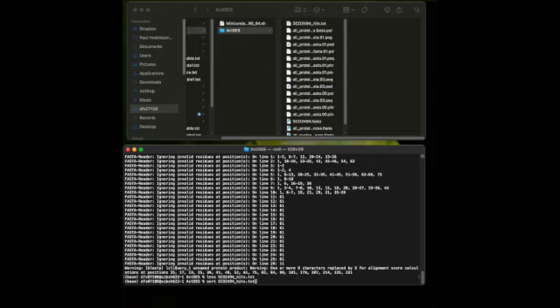And then what we can do is pipe that and use the unique function to identify all of the unique lines within that file, and create a new file that we can call SCO2494_hits, call it _unique.